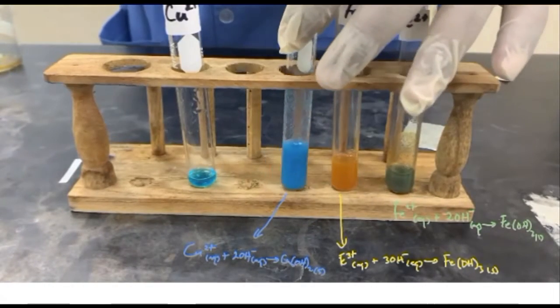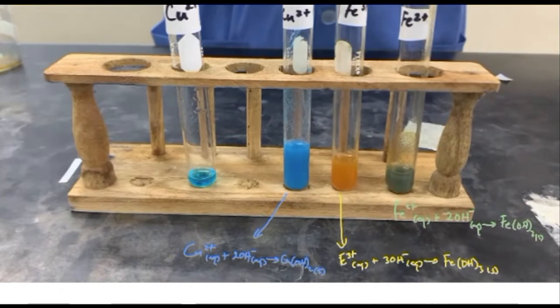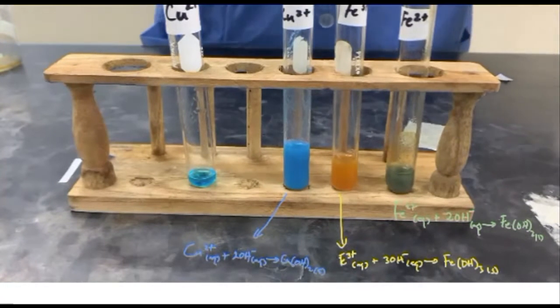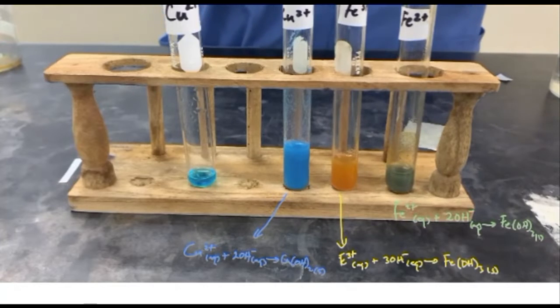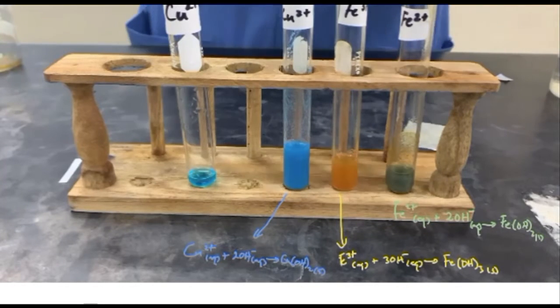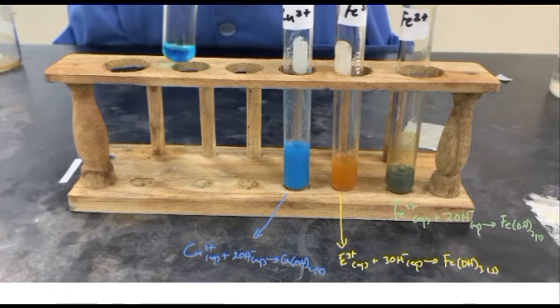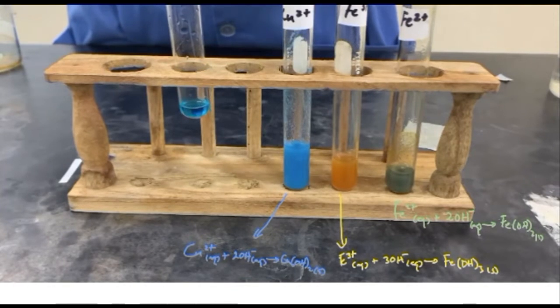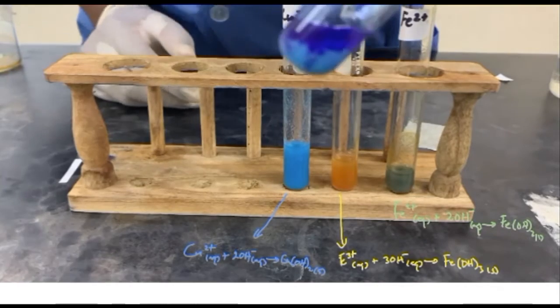Alright, to confirm the presence of copper, we can add a few drops of aqueous ammonia to a fresh sample of our copper 2+ ions in solution, or the suspected ions, but we know for this we're using controlled solutions. So there we go, and we get a blue precipitate.